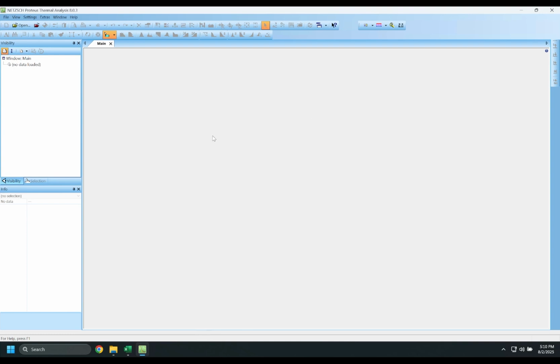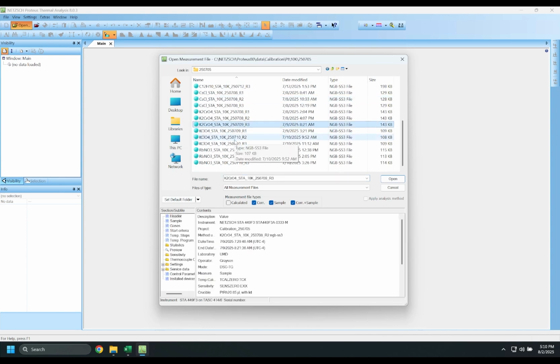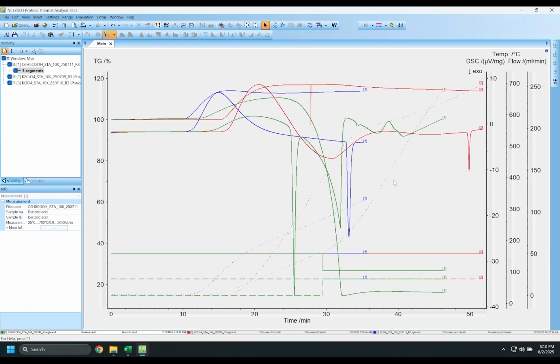Hey everyone, in this video I'll be showing you how to analyze data for calibrations in the Netzsch STA. So first thing I'll do is open up one of the correction files. In this case I'll actually open up a couple just to show you a couple different cases. So I'll just select a few of these. And I will load those into Proteus Analysis.